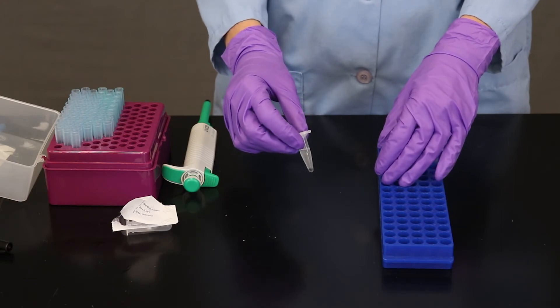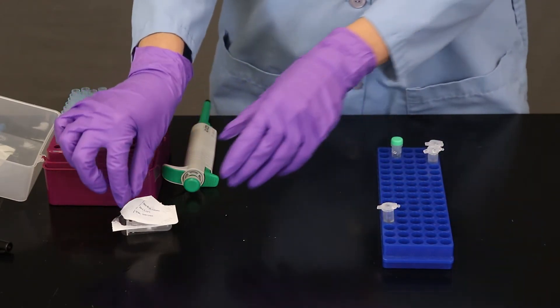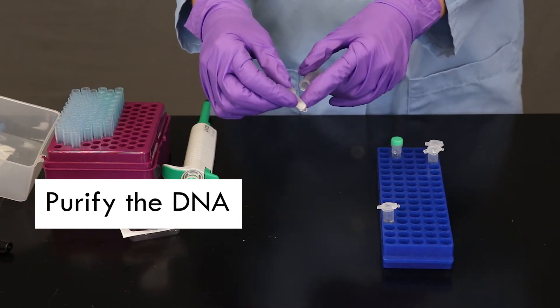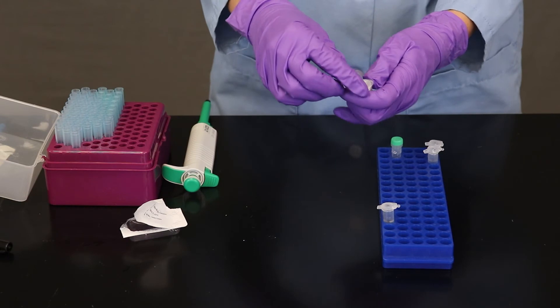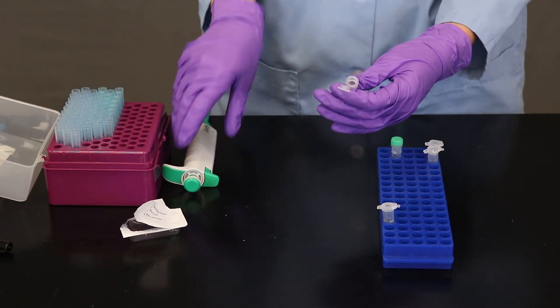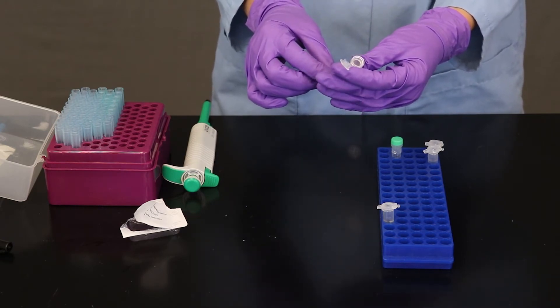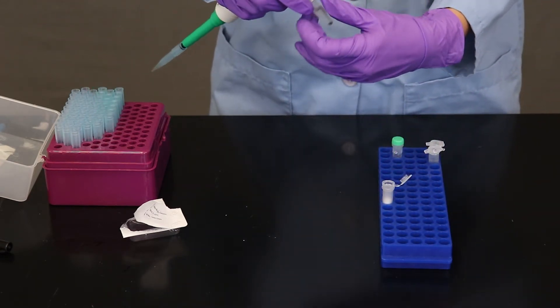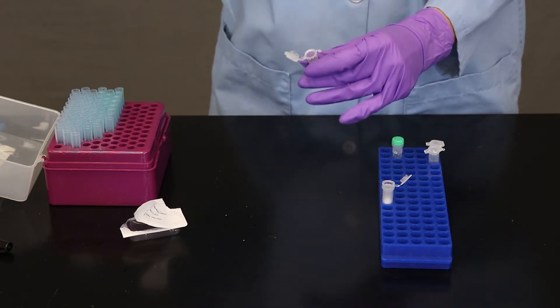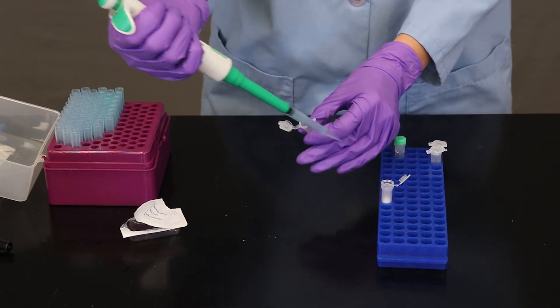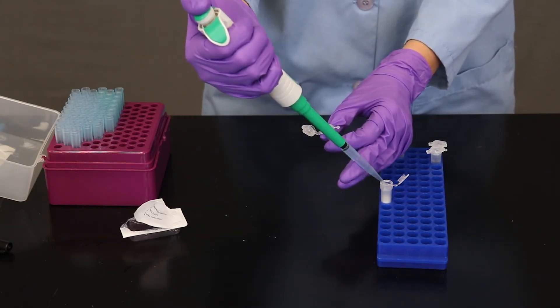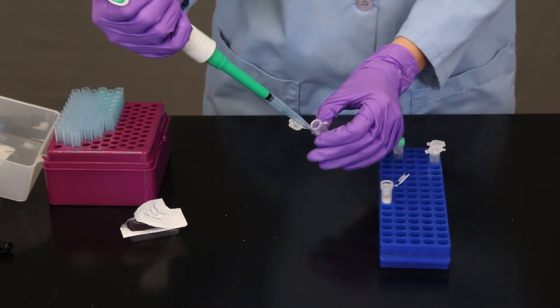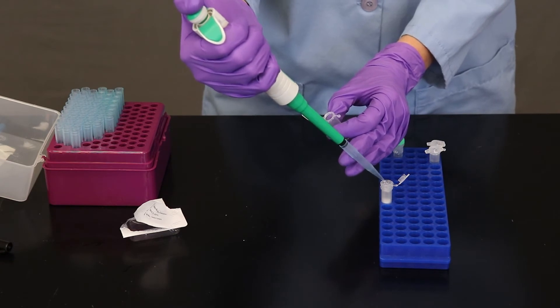So here we have our tube with the precipitated DNA because we've added ethanol to it. And we're going to use this mini column to help purify the DNA. So inside is a little tiny piece of filter paper and I'm going to pipette the DNA solution that I have into here. And we're going to spin it in the centrifuge so that it will push the solution through the mini filter. So I'm going to try to get all of this solution, but not get the insect bits.